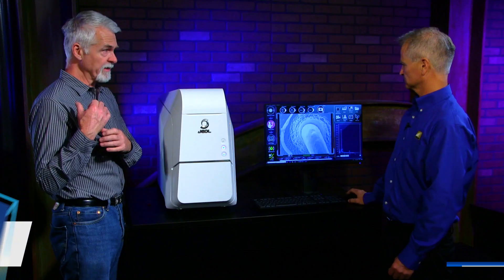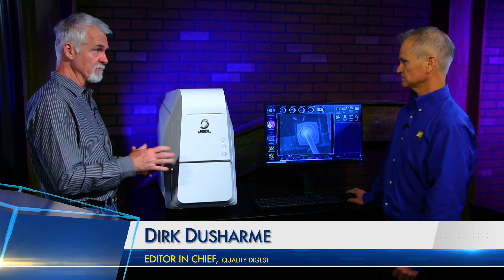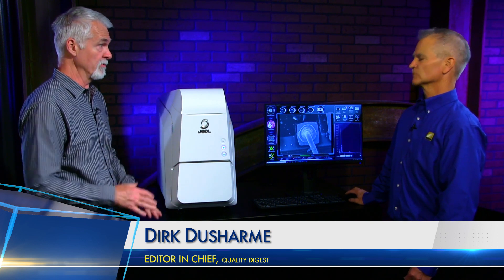That's being done live? That is live. As you move, you're going to get different elements that may or may not pop up as you move along. And then if I find a feature I really want to inspect more, I can always go right into the elemental analysis or the map analysis and display whatever's in that field of view as well.